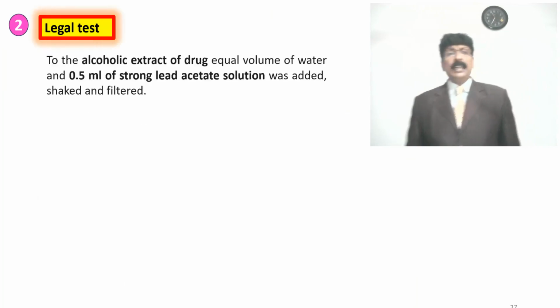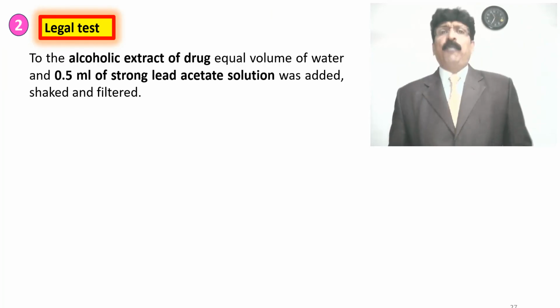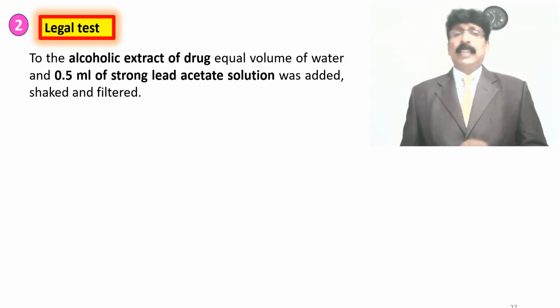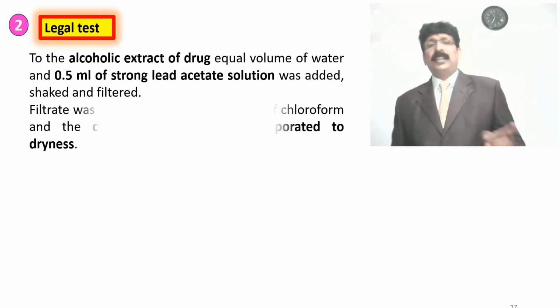Legal's test. To the alcoholic extract of the drug, add an equal volume of water and 0.5 ml of strong lead acetate solution. Shake and filter. You can filter.